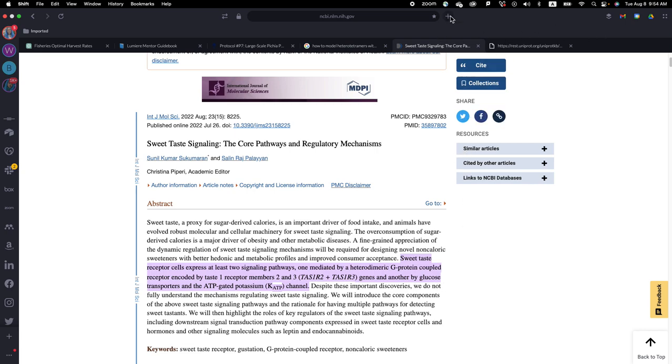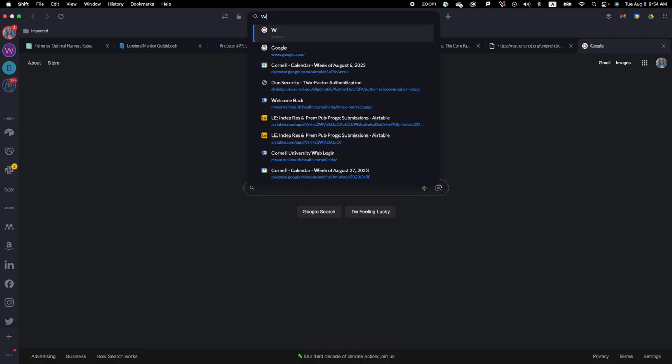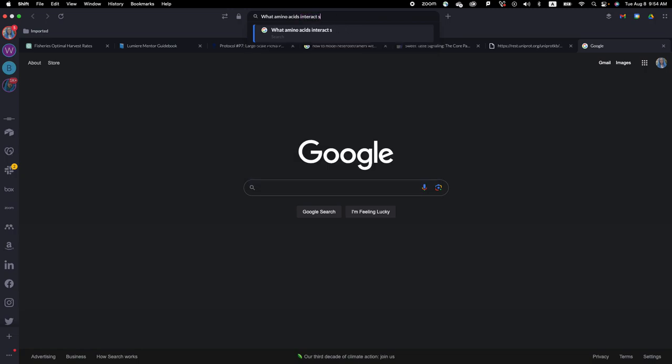And so what I would do is I would Google what amino acids interact strongly with potassium ions.